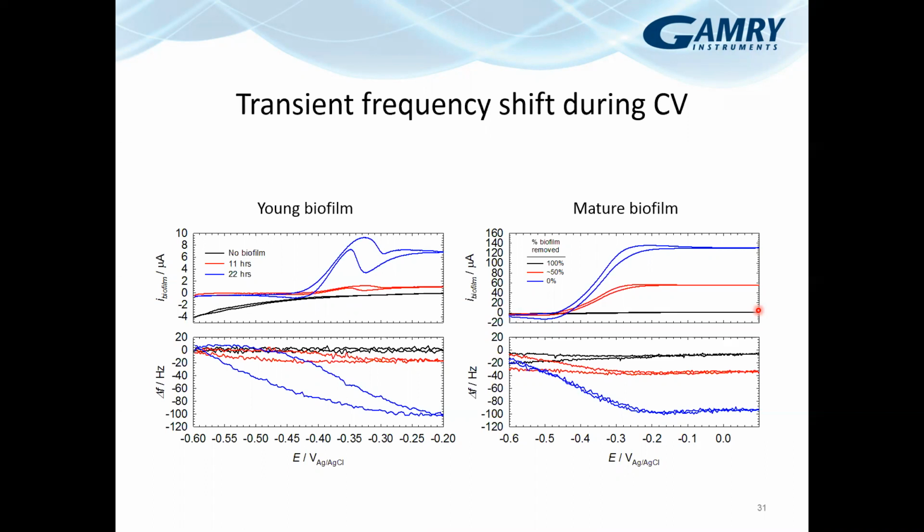Because electrons are flowing, there has to be a counter-ion flux, and this mass transport can be achieved in multiple ways. One way is that solvent can come in and out of the film. In our prior NMR studies, you would see the diffusion coefficient actually increase with this polarization, or oxidizing, of the film. That's in line with a drop in the frequency shift.